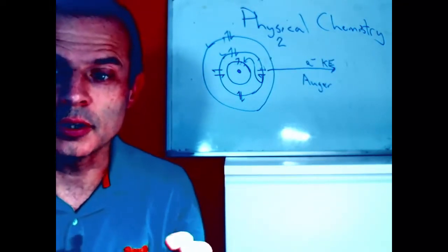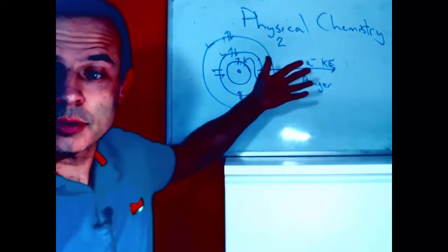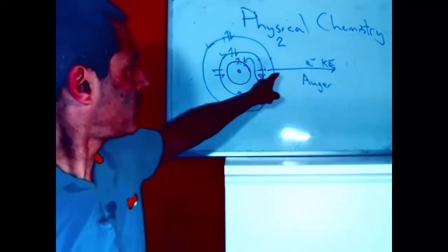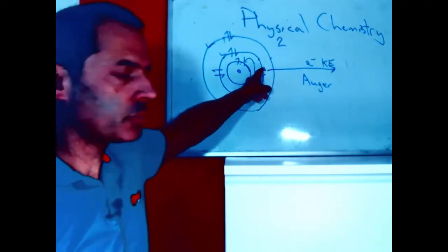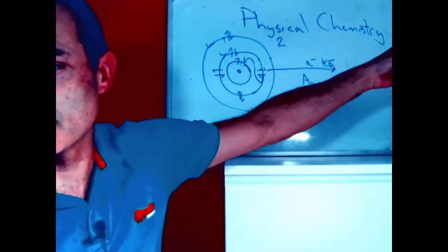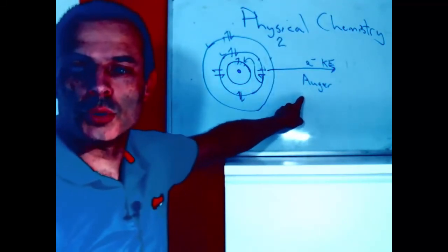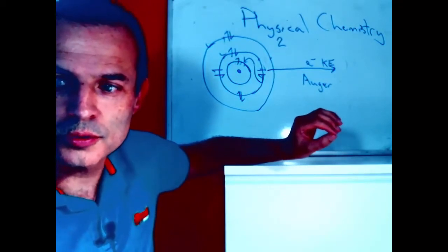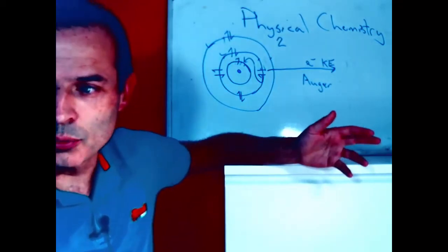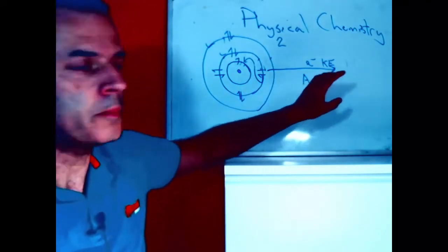In yet another possibility, instead of giving out a photon, an X-ray, when dropping in, it can donate that energy to another electron, which will come out of our core of our atom, and that is an Auger electron. In this case, 3 electrons are involved, and so once again we get more information about the energy levels and the bonding.